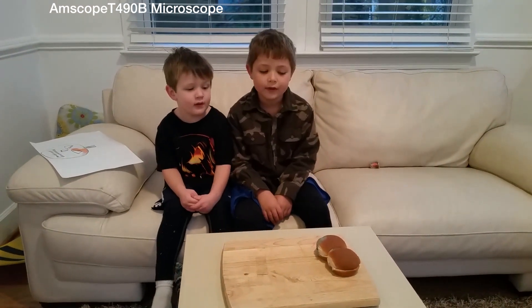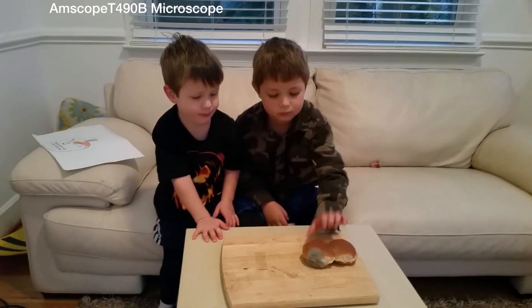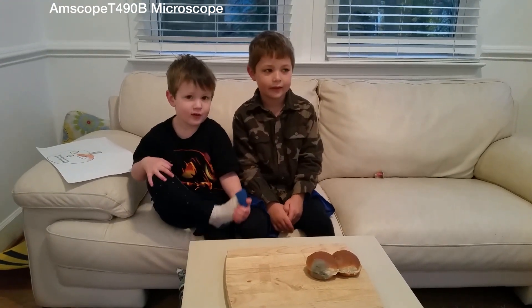Alright, what do we have here? Moldy bread. Pick it up and show us the moldy part. Yeah, what are we going to do? We're going to take it under the microscope.